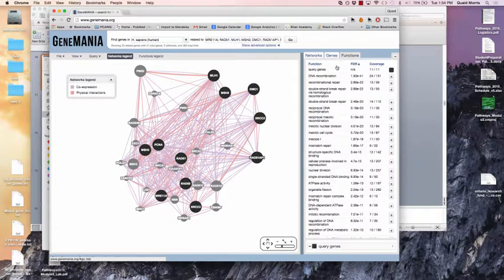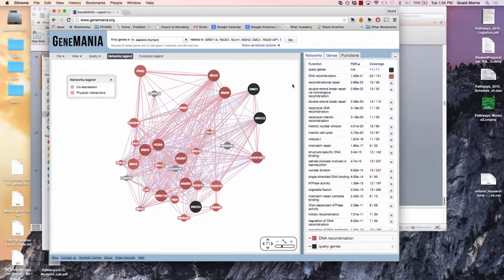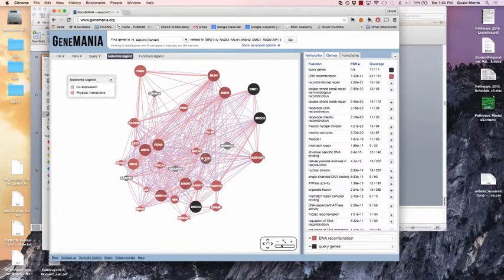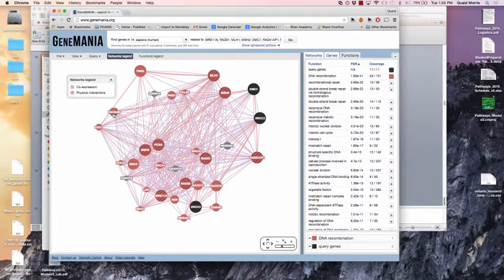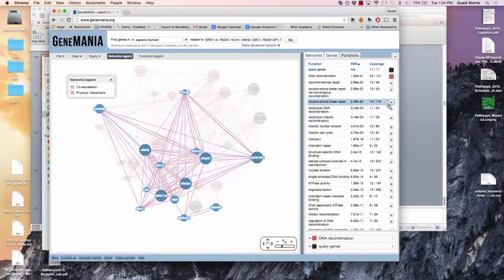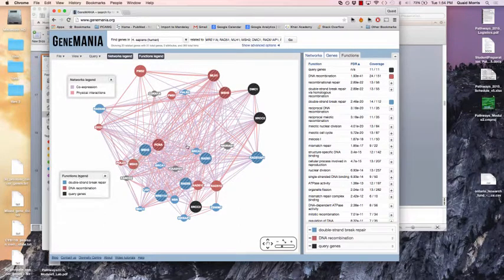You can go through and look for enriched functions. This list is a list of genes involved in DNA recombination. The ones in red with dashes through them are the ones in DNA recombination that were enriched on the list. The smaller nodes are ones GeneMANIA has added — other genes also involved in DNA recombination and double-strand break repair.